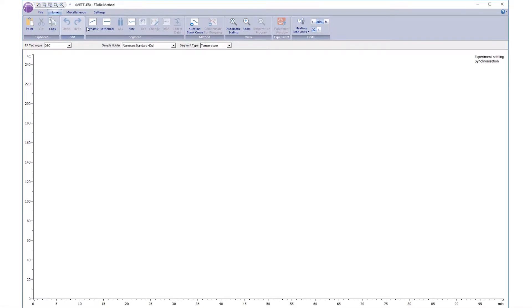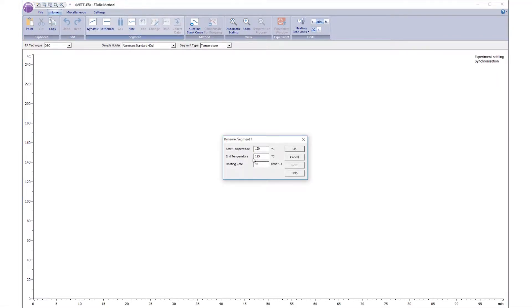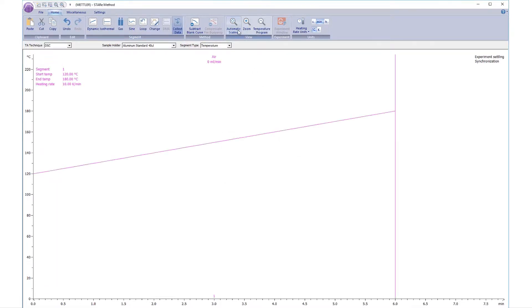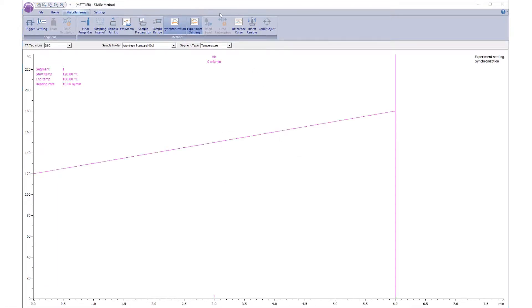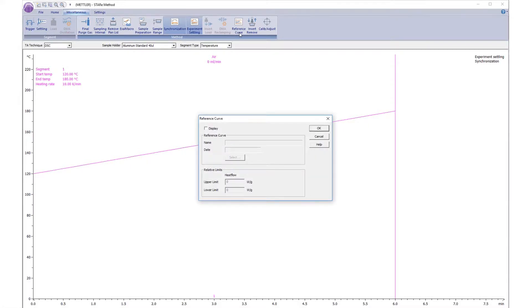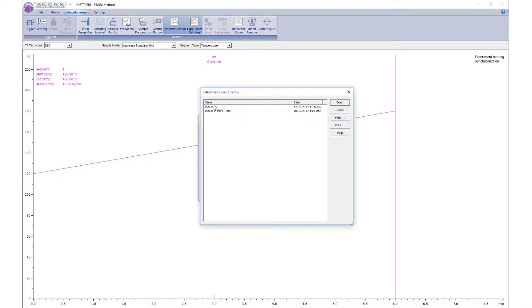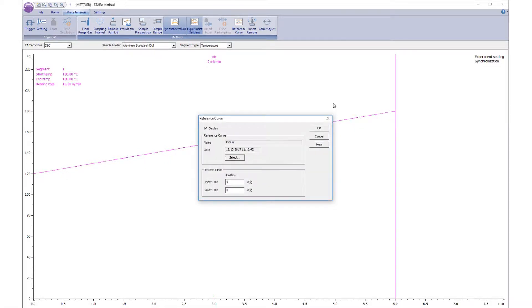Create a method in the Method window. Select Reference curve under the Miscellaneous tab and click on the Reference curve icon. A dialog box will appear. Check the Display box and click on Select to choose a reference substance from the database. Finally, choose the upper and lower tolerances.